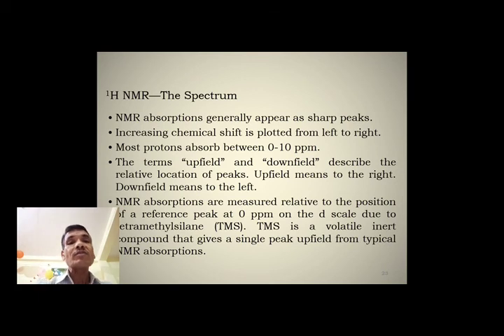The NMR absorptions are measured relative to the position of the reference peak at 0 ppm on the delta scale, due to tetramethylsilane. This TMS is a volatile compound.